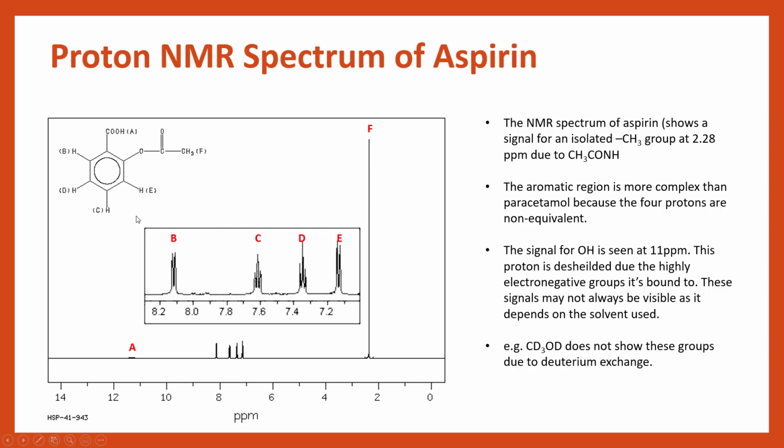It's beside 1 hydrogen or 1 proton. Again, that makes sense because this hydrogen is bound to 1 carbon that has 1 hydrogen. But obviously, the way we have it represented here, it looks like this hydrogen is directly beside it, but it's not. It's a few bonds away. So this hydrogen is beside 1 hydrogen here, and again, that makes sense.